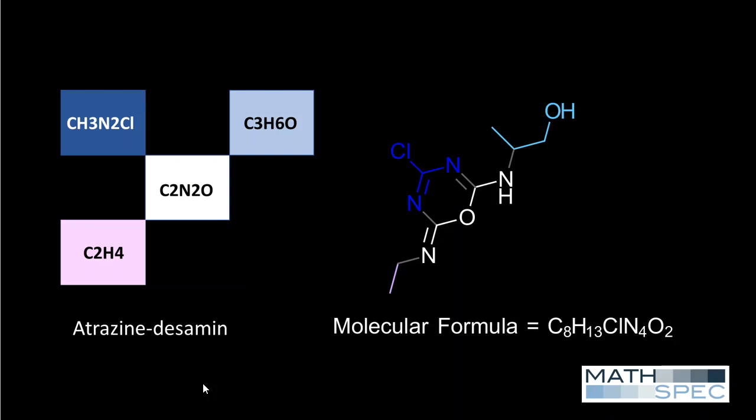Now, two other structures were consistent with the same modular structure, but there was no plausible way that these structures could be formed without cleaving the side chain. Although this structure may make sense and is probably correct, this identification is still tentative. There's always some ambiguity in the interpretation of mass spectral data of unknown compounds.